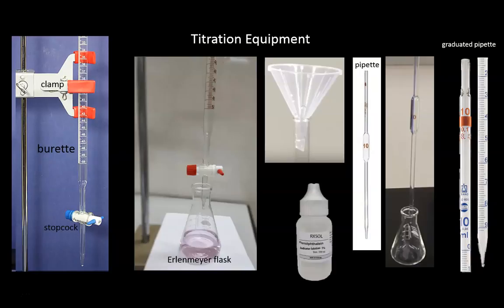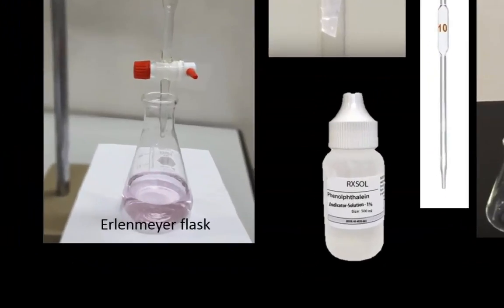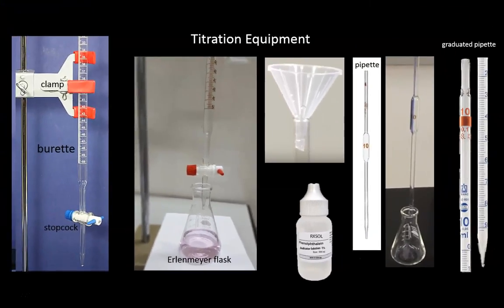Finally, we need to have an indicator for any titration. The most common one for acid-base titrations is called phenolphthalein. These are the main pieces of apparatus or equipment for a typical titration.